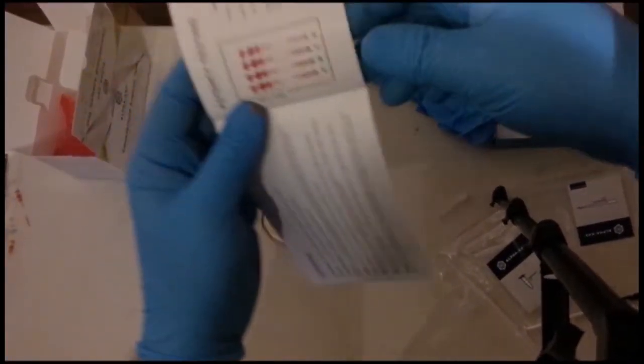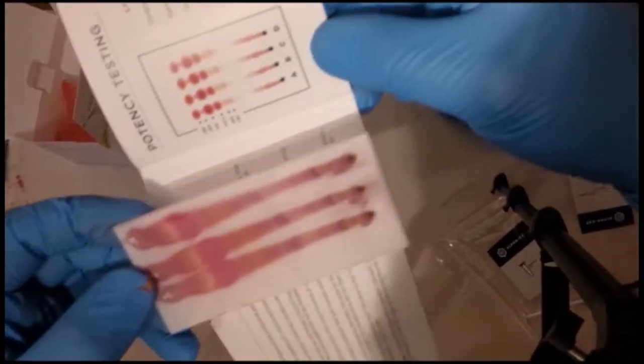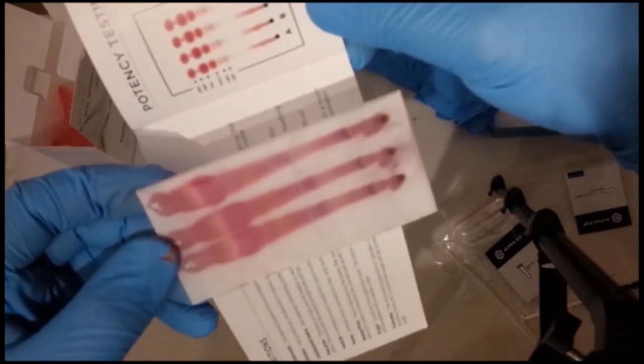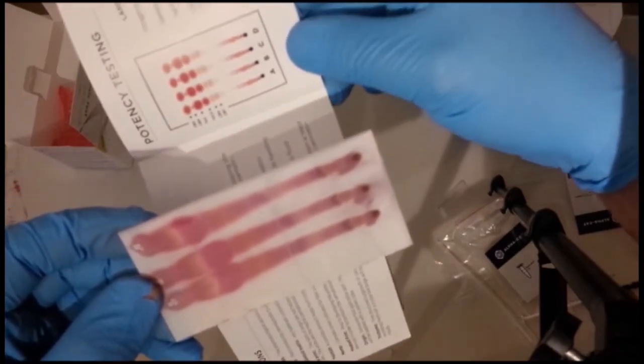Now, using the supplied chart, we can try to get an idea of the potency of our sample. However, upon using the sizing guide, it is clear that the THC levels are off the charts. We are unable to get an idea of the exact percentage. However, at least we can get a good idea that when our RSO oil is looking like this, we are getting exactly what we have paid for.